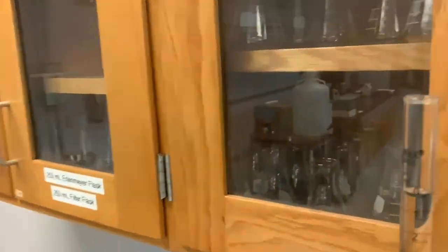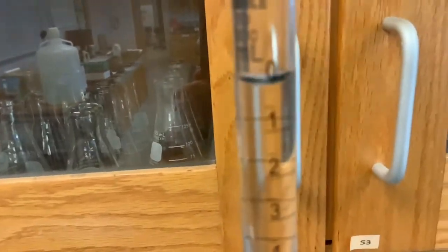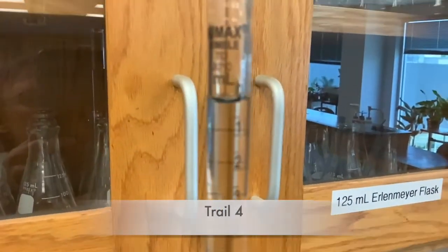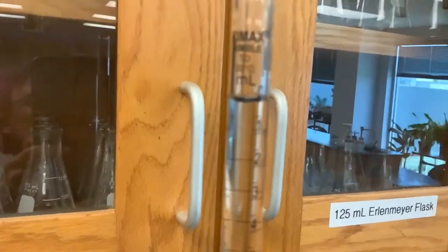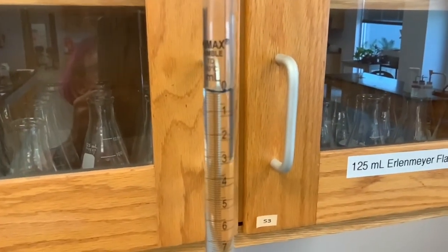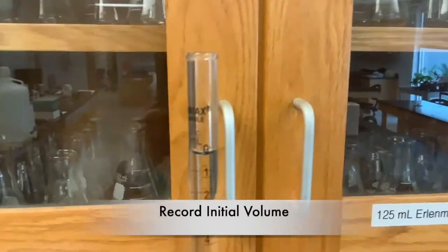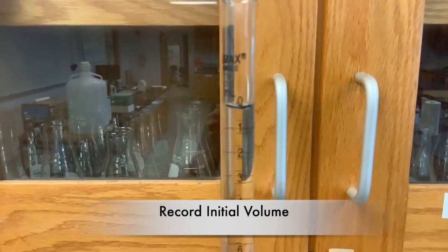So we've filled up our burette again. So again, we want to make sure that we get that. Get it to focus. That initial reading.